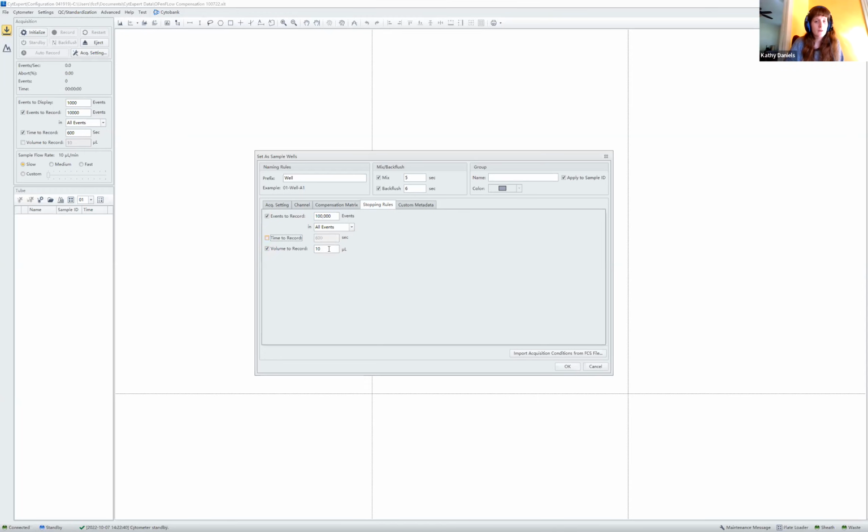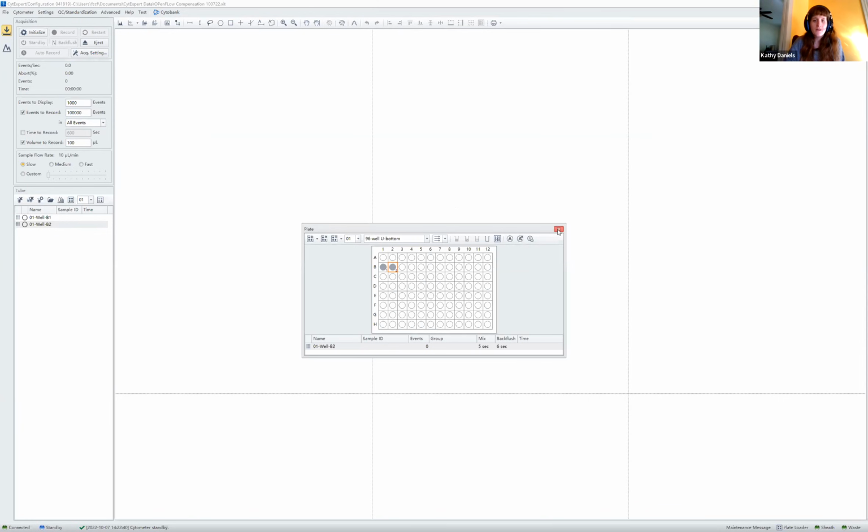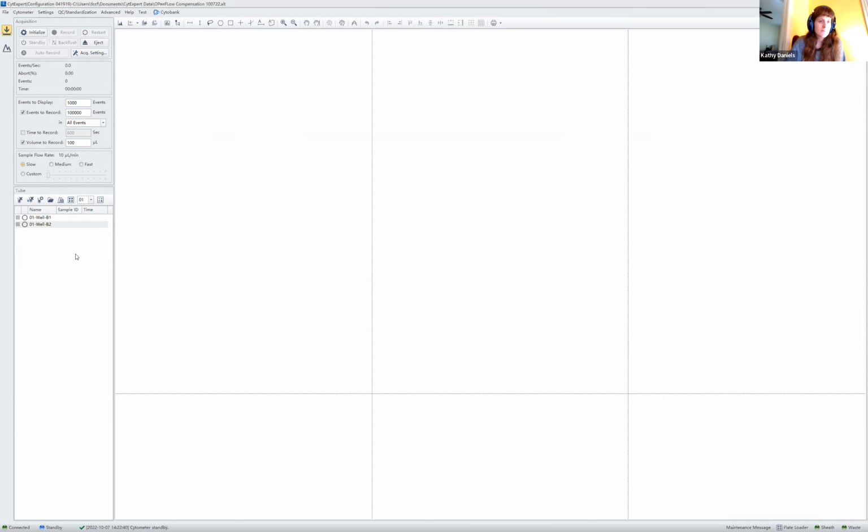So if I say I don't care about time, but I want to make sure I'm not recording more than 100 microliters, I can select OK there and select OK. It's going to give me this warning that I don't have time to record, and that's fine. So I'm going to select yes, I want to continue. Here you can close out of this window, or you can keep it open. I'm going to close it to give us more space.